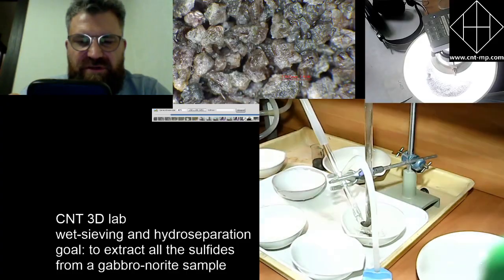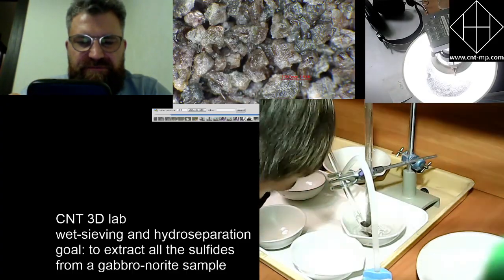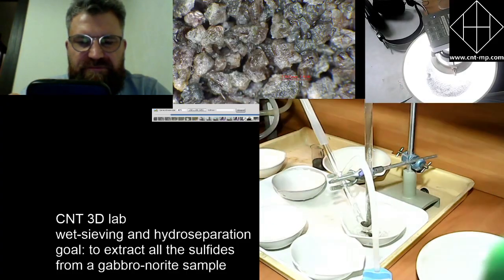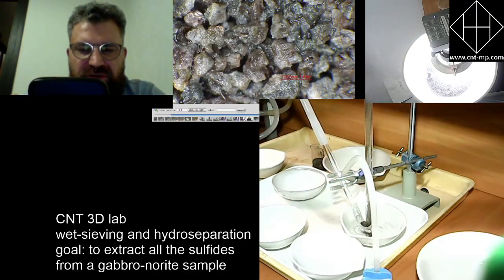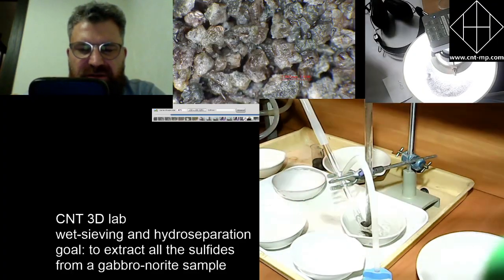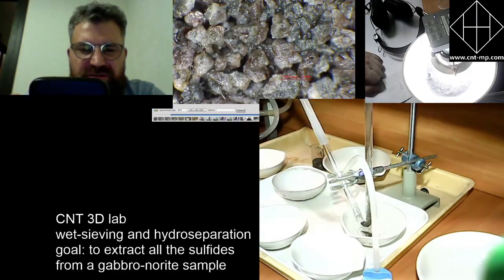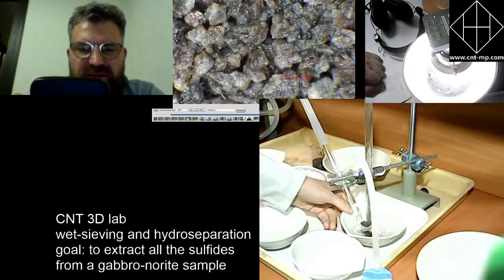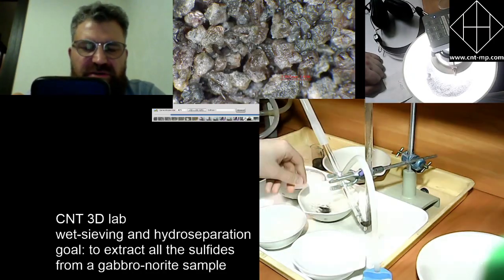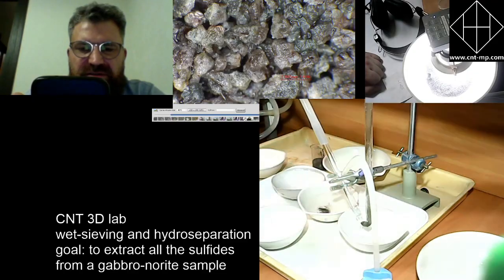Can you reload? Alec, do you hear us? It's okay. Can you just reload the amount of material from the GST and show the concentrate? The guys want to see how you reload from the tube.